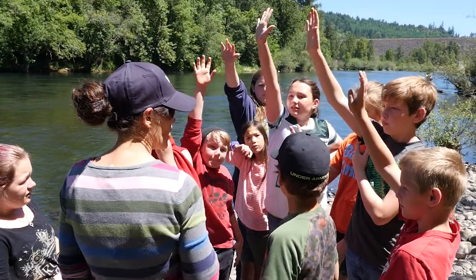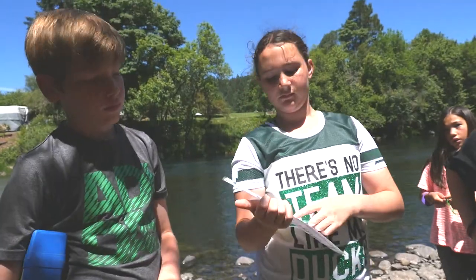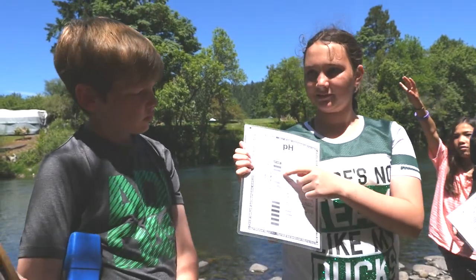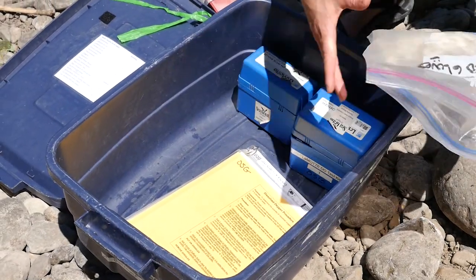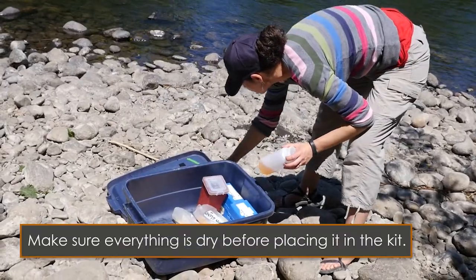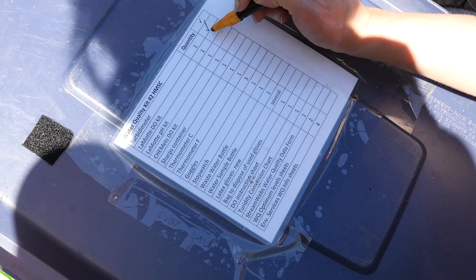At the end of the day, have the students discuss their findings. Once the students have brought back all of the field equipment, make sure that everything is well organized and use the checklist to be sure that nothing is missing.